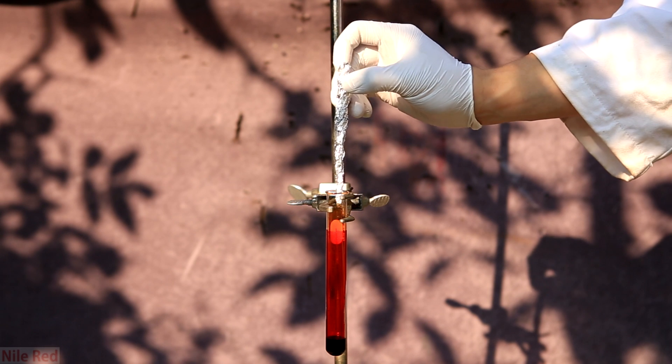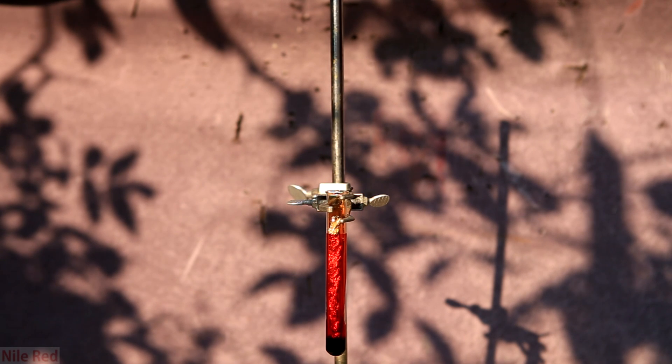Then, aluminum foil is added to the test tube. Due to the protective oxide layer on the outside of the aluminum, it takes a little while to react. The aluminum reacts violently with the bromine to form aluminum bromide.